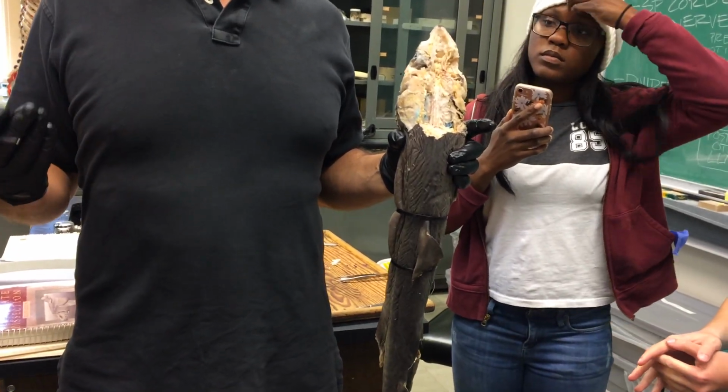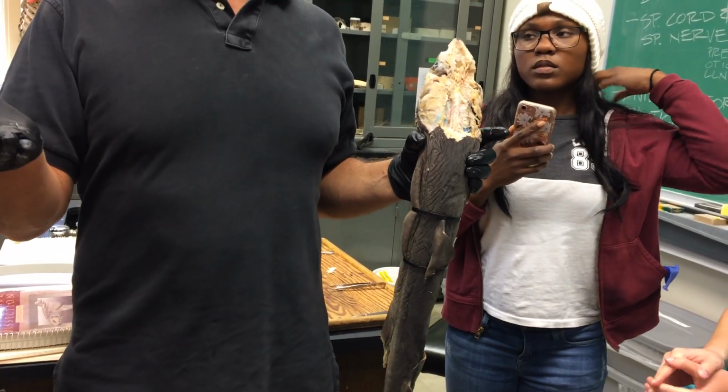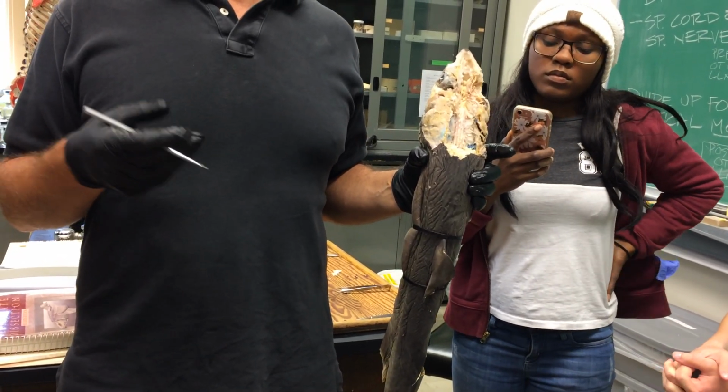And we're not removing the brains from our sharks. I told you don't, because it just makes a big mess of them to do it. But if you did and flip the brain upside down, you could see the hypothalamus in that region on the underneath.